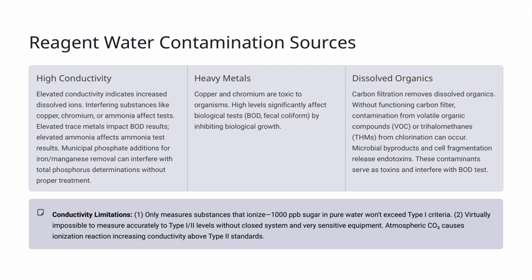Plus, atmospheric CO2 can cause ionization reactions that artificially increase conductivity readings beyond the standards for type II. So, understanding these sources and limitations helps us better control and interpret water quality tests.